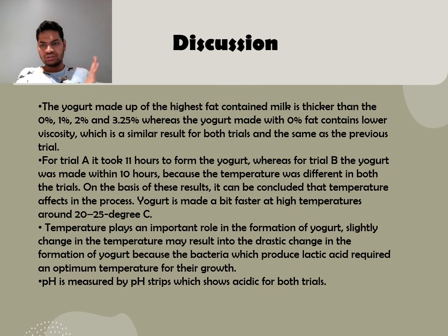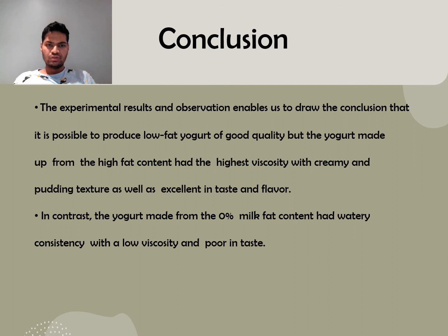From the conclusion, we can draw that it is possible to produce low-fat yogurt of good quality, but the yogurt made from the high-fat content has the highest viscosity with a creamy and pudding texture, as well as excellent texture and flavor. In contrast, the yogurt made from the 0% milk fat content has a watery consistency with a low viscosity and poor taste.